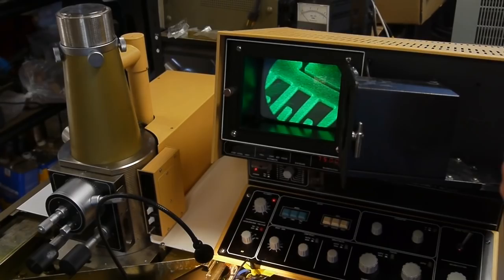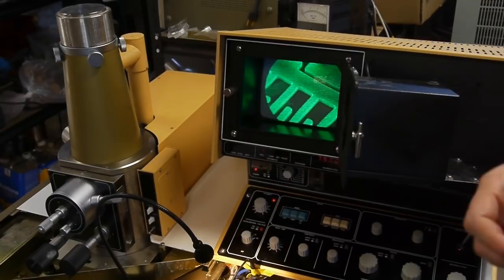All scanning electron microscopes, including the latest cutting edge models, have to get around this problem of dealing with low signal.